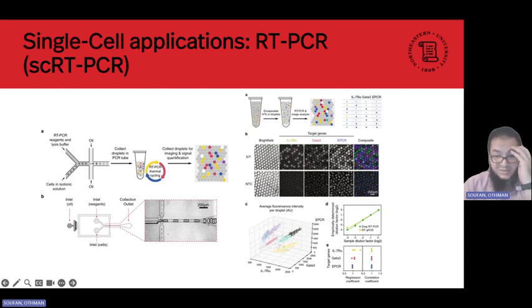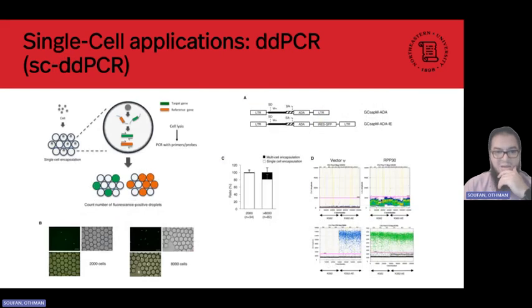At the end, there will be some nice, interesting visualizations, as you can see here, where we can cluster and experiment with some types of different cells and see if there's any different behavior or pattern. And this also brings this idea of single cell encapsulation. Start looking at counting the number of positives or negatives when there are two different genes, target and reference gene, in different cells. Eventually, we have thousands of cells that we can screen and see the output, to do a comparison of different experiments.